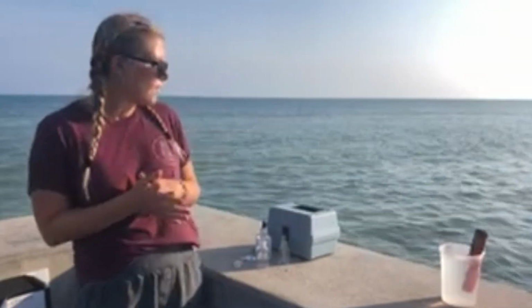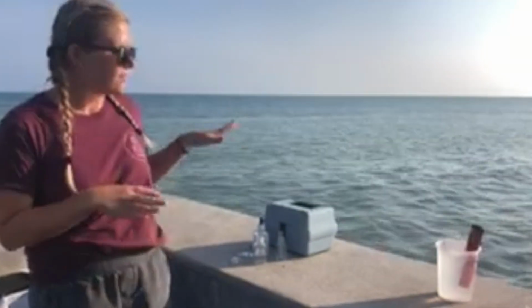So we are going to check DO, or dissolved oxygen, as well. We need oxygen to breathe, and so do fish and all other marine animals. This is another great indicator of how healthy our ocean is, because if there's no oxygen, then our fish and our mammals and our animals altogether are not going to be able to breathe. If there's way too much oxygen, it's going to throw their bodies out of balance. So once again, the common theme between all these different things that we're testing is that you need to find balance and equilibrium. For dissolved oxygen, this one's the most complicated out of all of them.